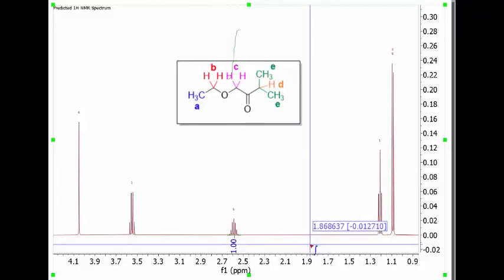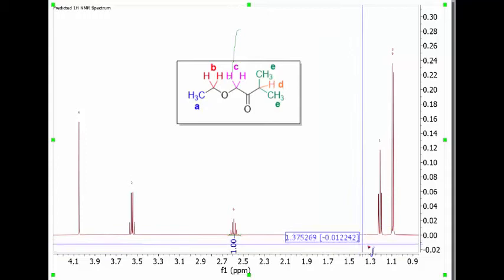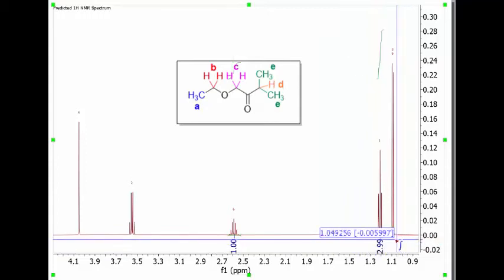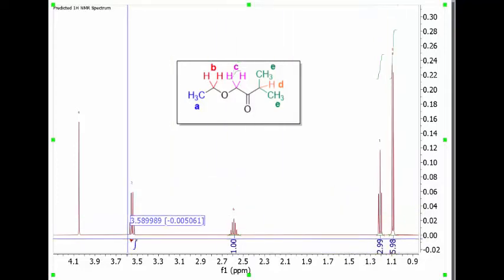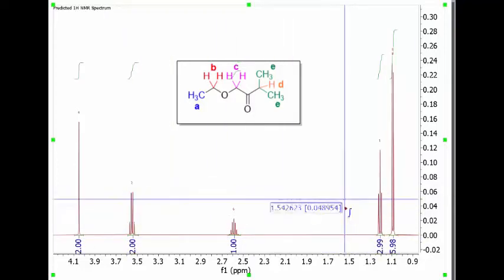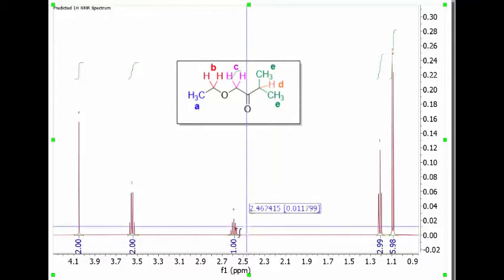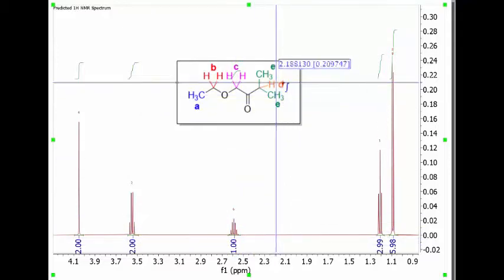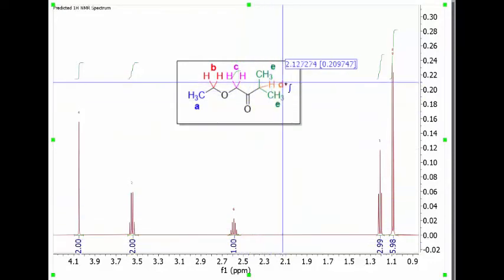Now, since I integrated it first, of course it's going to be 1, but my prediction is that all other peaks will be taller. So let's integrate this guy, which is probably going to be 3, and this guy over here should probably be 6 then, and then these guys should both be 2. Alright, so there are the actual integrals, and now, based on inspection, we can go ahead and assign several of these. So we mentioned that this is the one, both because he's small, but also because he's the most complicated looking guy. So when you go to the multiplicity video, you'll see why that is.